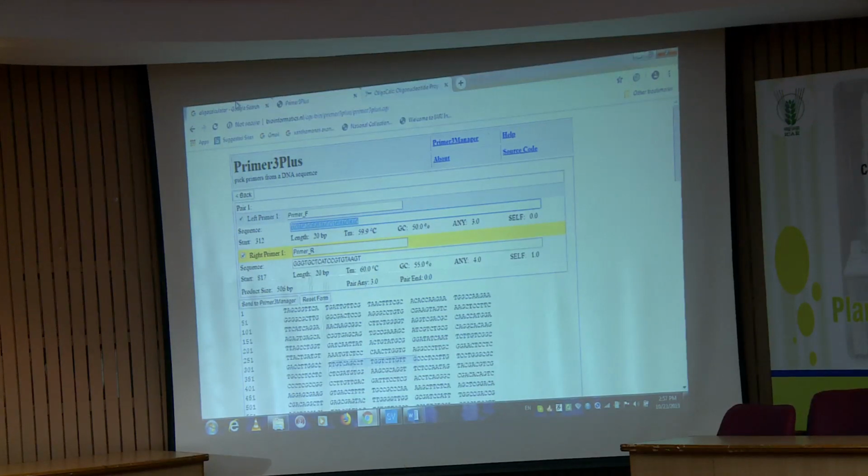Now your PCR amplification is done. You can send those PCR products for Sanger sequencing. You have to send the amplicons, and of course your primers, to the company, because they will be using these primers for the sequencing. It depends on how much region you want sequenced. For Sanger sequencing, the company commits that they can give you around 500 to 600 good quality bases.